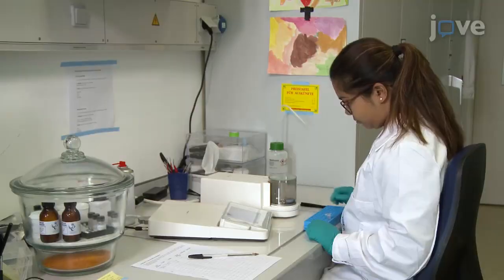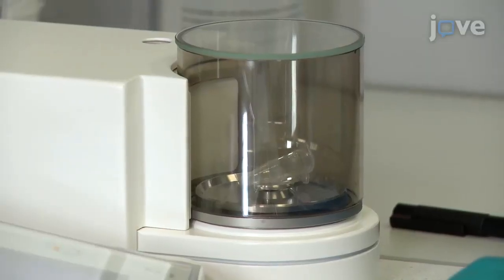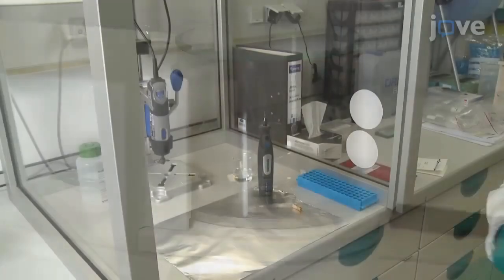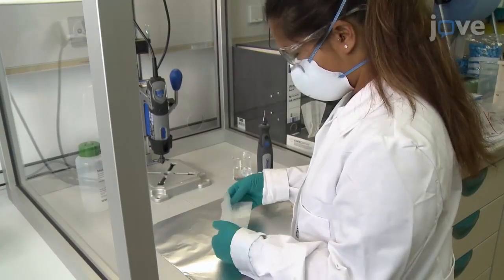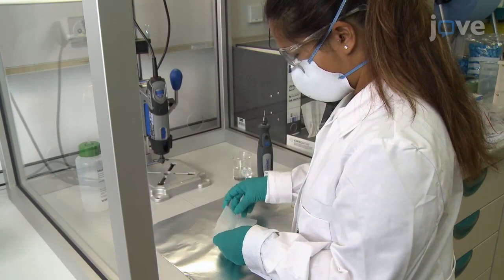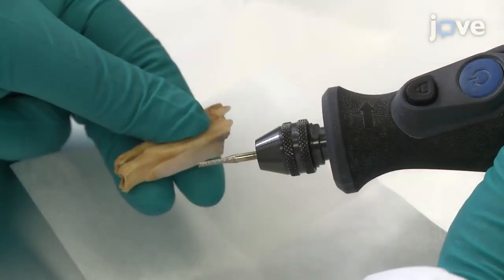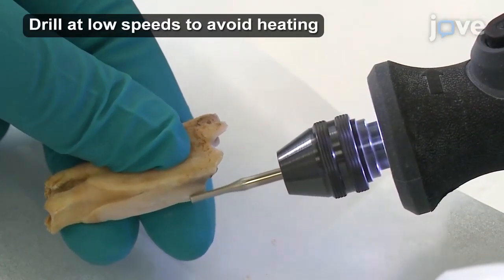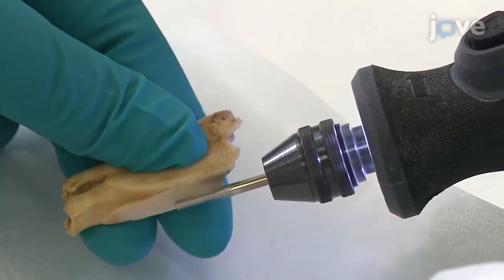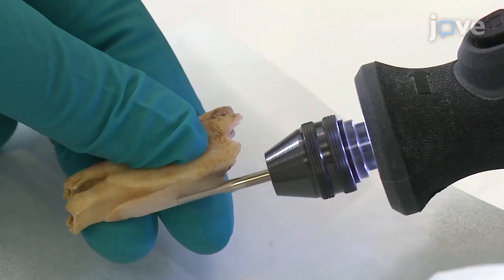Tare a 1.5-milliliter microcentrifuge tube on an appropriately accurate balance. Then place clean aluminum foil or weighing paper under the drill to collect the enamel powder. Use the drill to deliver gentle and even abrasion, creating a groove parallel to the entire growth axis.